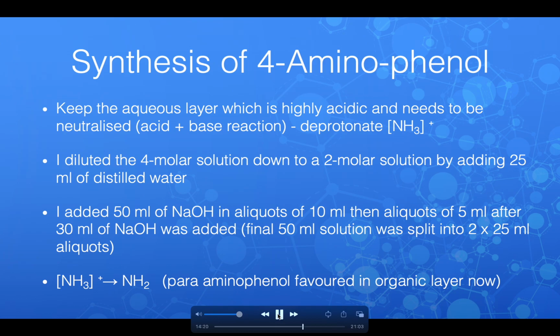However, upon further analysis through NMR, we discovered that we were left, in fact, with paracetamol, which would suggest that either the right solvent was not used or that the reflux was not carried out for long enough.